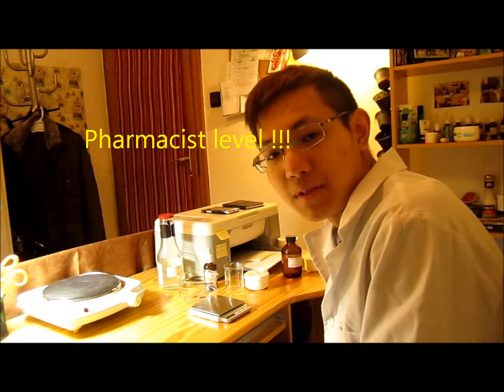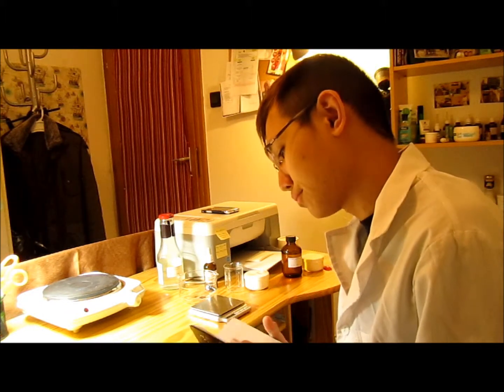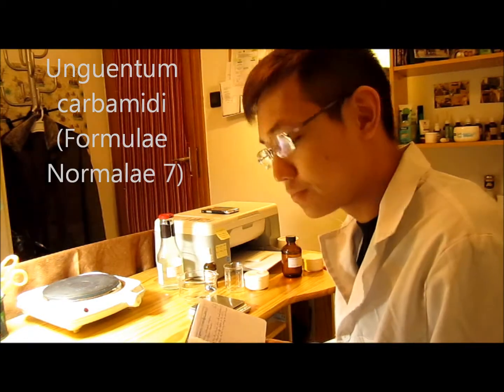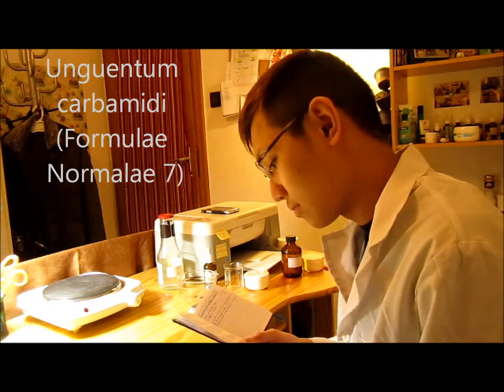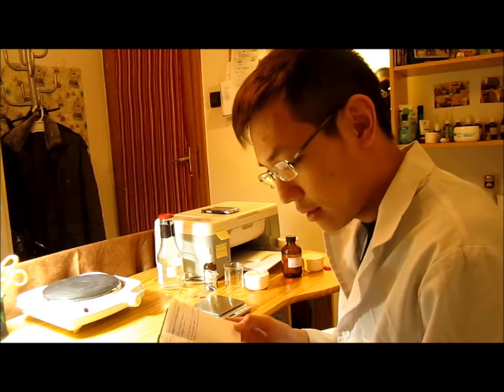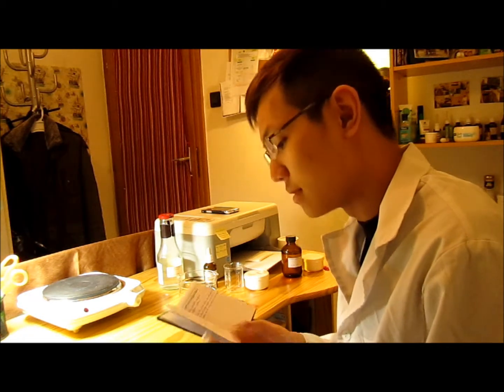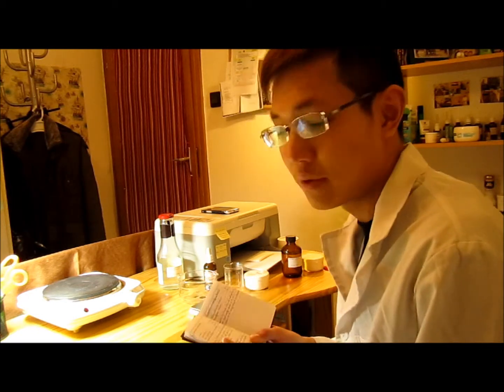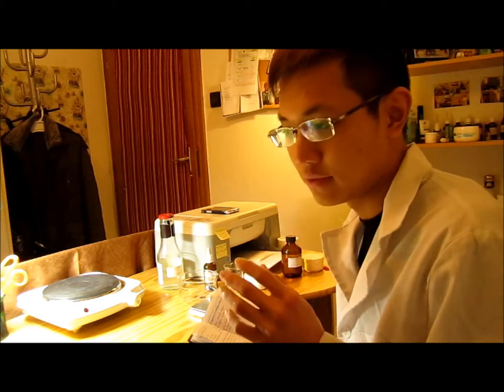Hello, my name's Won, and right now I'm gonna show you how to make a cream for the treatment of keratinization of the skin. It's called Unguentum carbamide, containing urea. The reason why this cream works against keratin in the skin is that the lactic acid content of the cream will actually dissolve the keratin.